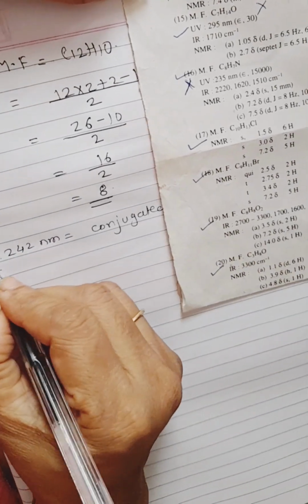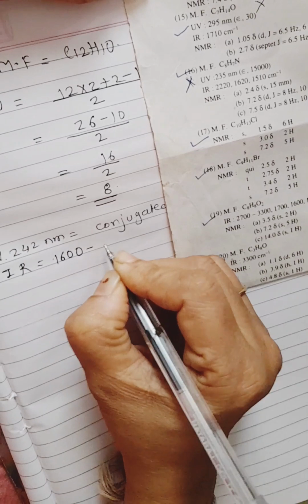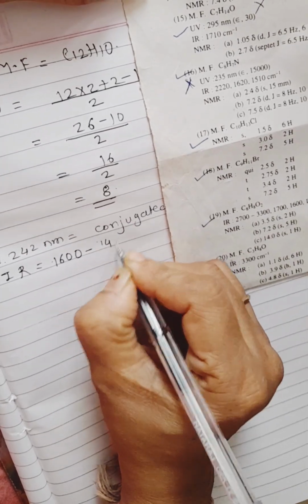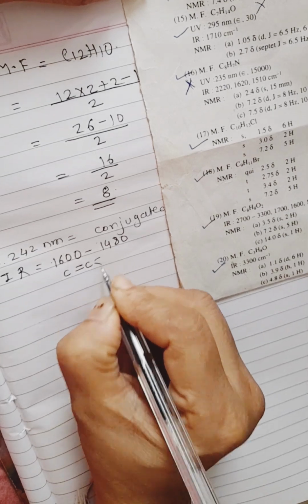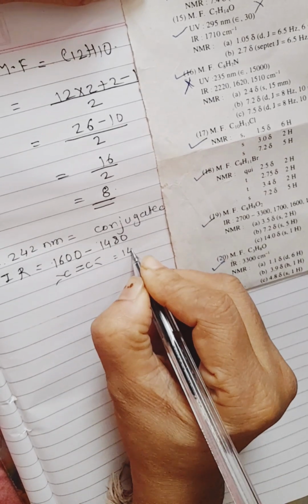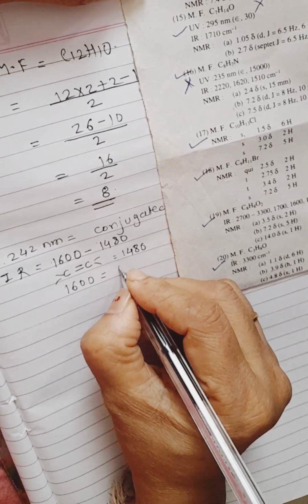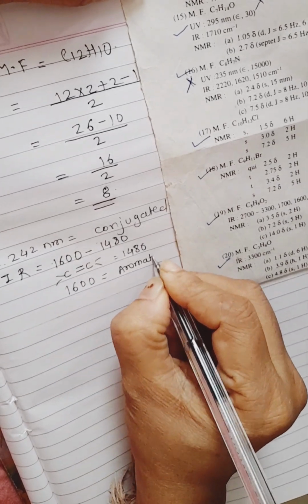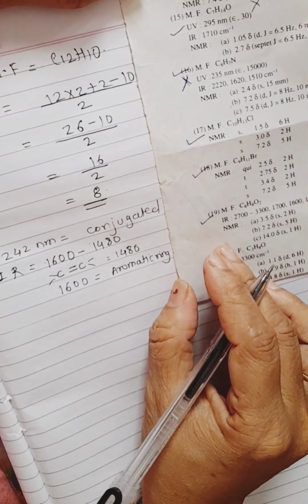Then the IR data, 1600 and 1480, clearly indicates that there is a carbon-carbon double bond. We see 1480 and 1600, which shows that there is an aromatic ring. Isn't it? There is an aromatic ring.